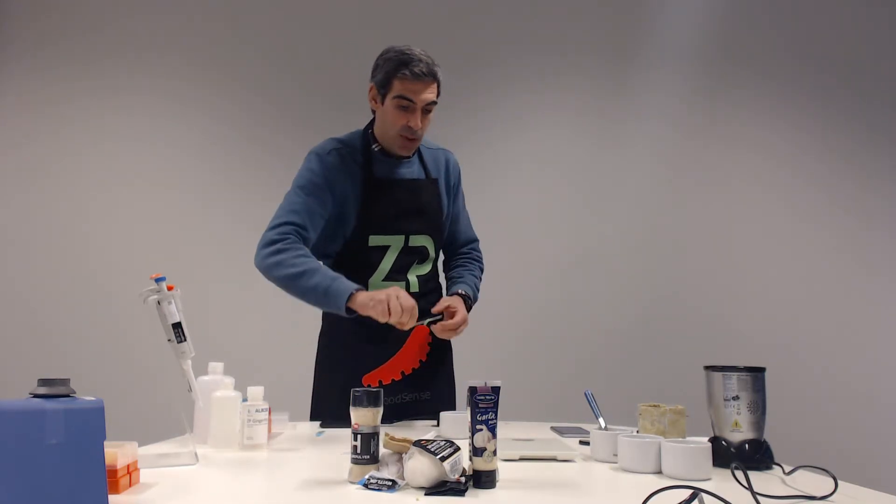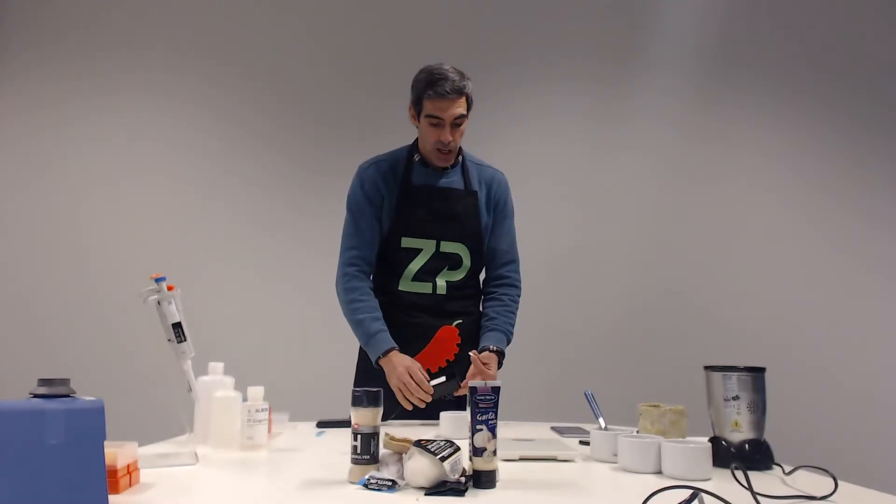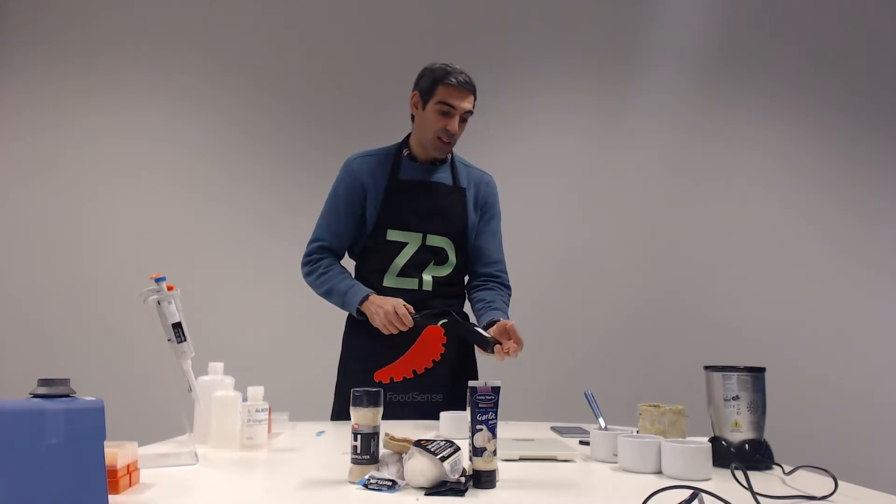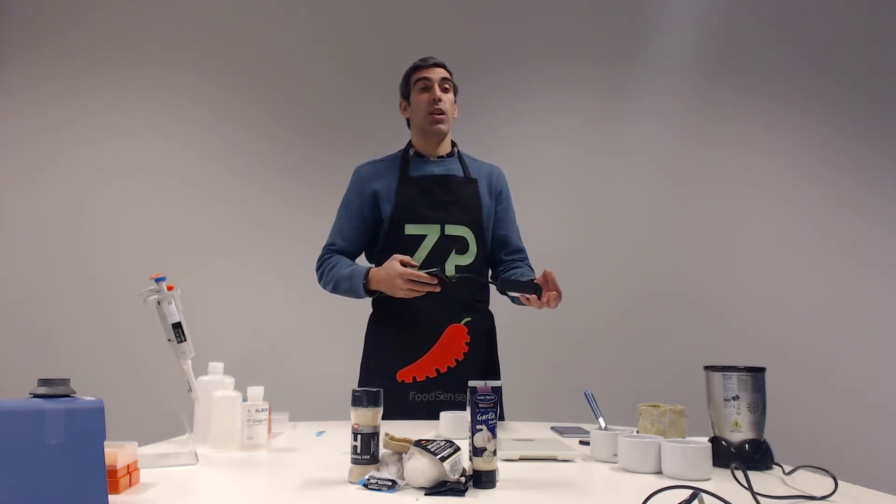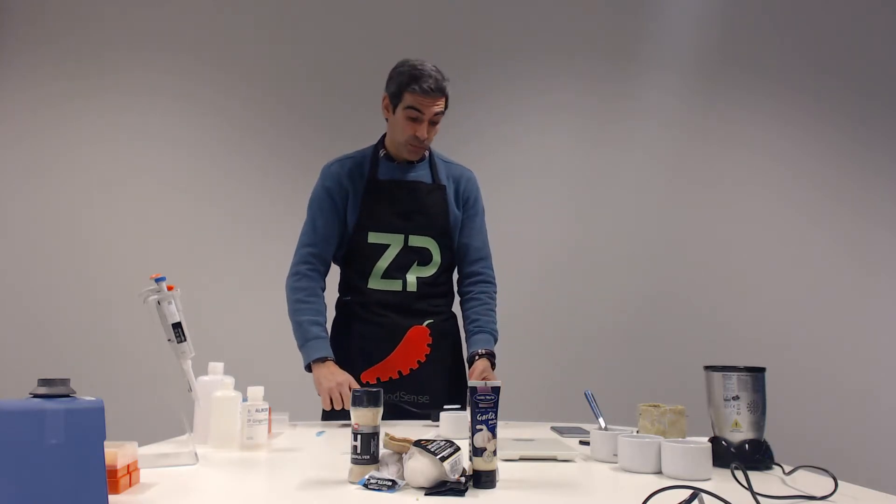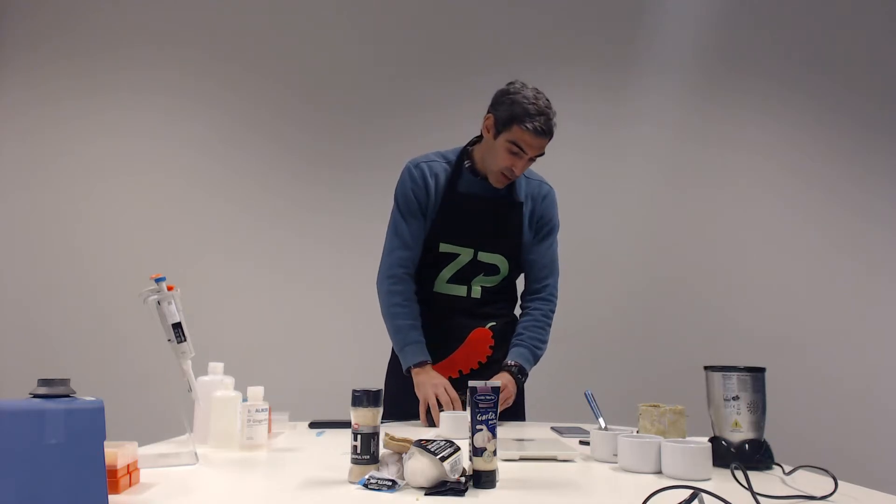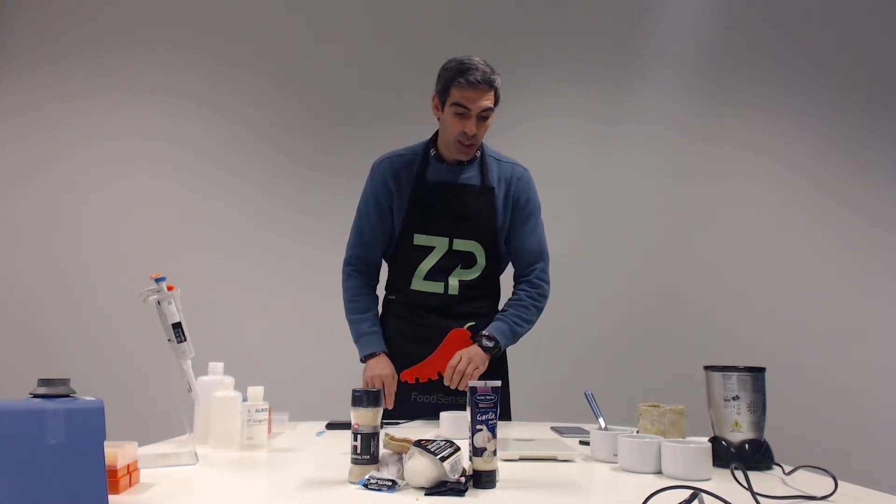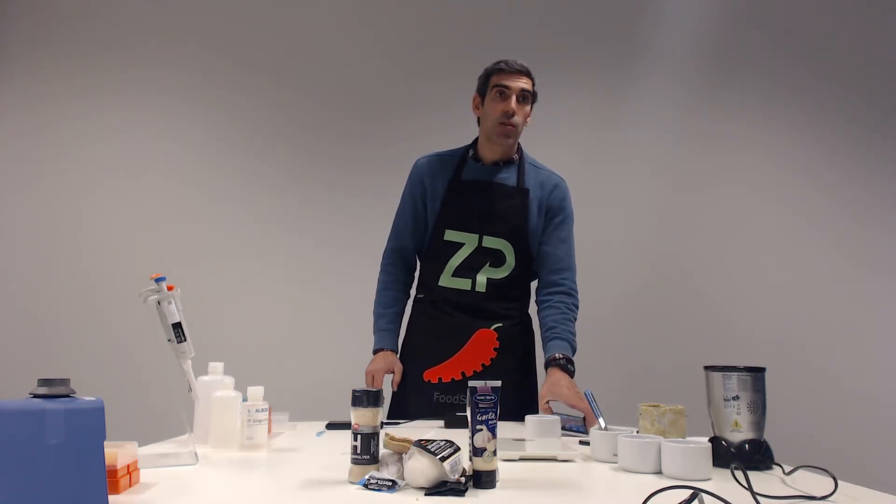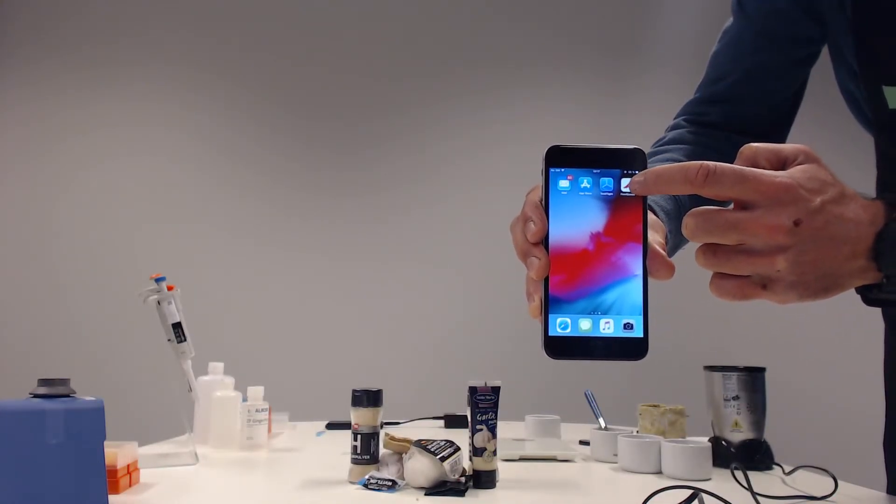I'm going to snap from this strip one of the ZP Ginger sensors and insert it in the FoodSense device. The FoodSense device is connected to a battery pack on USB 2 output. You want an output with five volts and with a current up to two amps output. So I'm connecting the sensor. Now I will need to open the app, the FoodSense app. I'll come a little bit closer to the camera so the user can see.